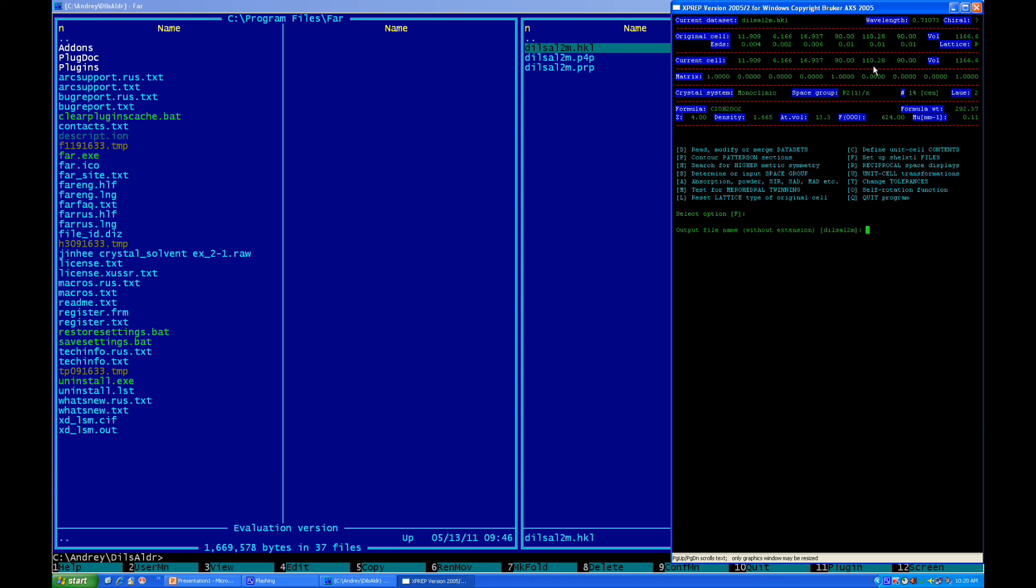After that, we're setting files for structure solution. What I usually prefer to have is, I prefer to have different names for files for crystal structure solution. Because, you don't wanna override any of your initial p4p and hkl files. You always wanna come back to this data, so you'll have some kind of, like, small backup. Let's give it some different thing, short, which is nice to type. I call it Dils. D-I-L-S.